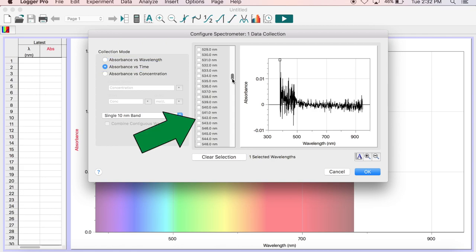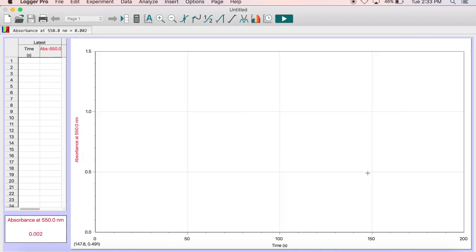For this demonstration, I will set the wavelength to 550 nanometers. But this will differ depending on the type of drug solution you use. Consult your project guide for more specific information.